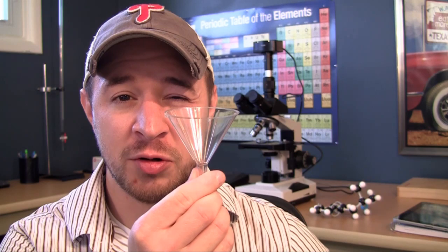What's going on guys, it's Bucky and welcome to another chemistry lab tutorial. In this video I want to talk to you guys about a piece of equipment that every chemistry lab should have, funnels.